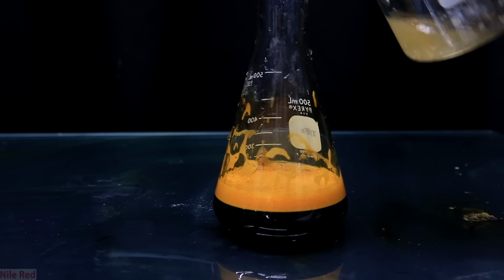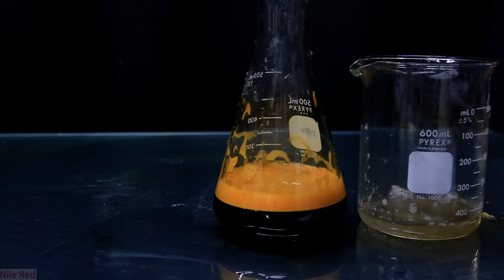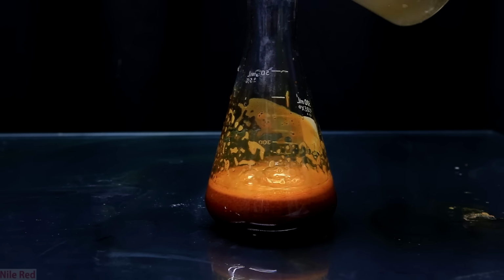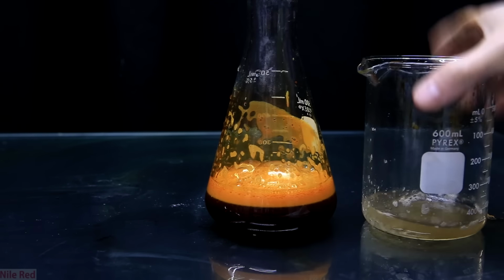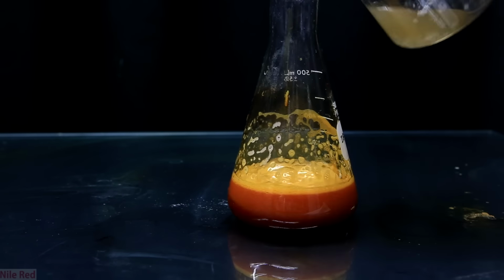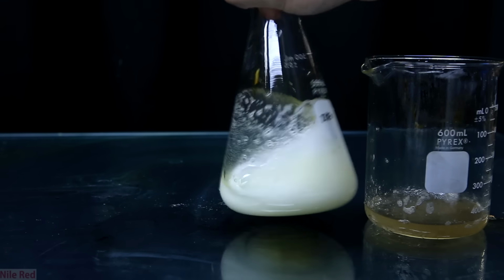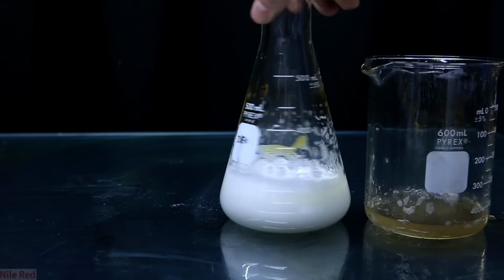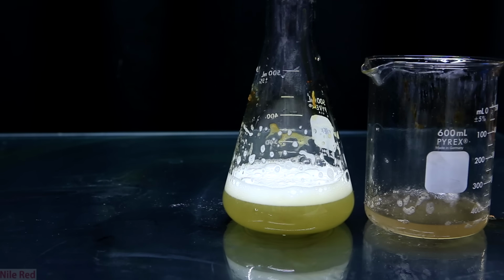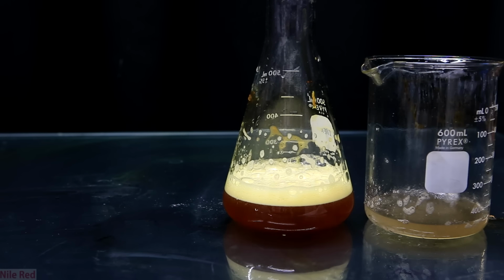Now for the interesting part that I totally didn't expect, but I probably should have. I added sodium thiosulfate to the hydrogen peroxide solution that we filtered the iodine out of. When this happens, the color immediately disappears and it becomes clear again. I'm not sure why, but the solution that we originally filtered the iodine out of was pretty clear, but after letting it sit out for something like a day, it became dark and reddish like you see here. Anyway, the cool part is that it quickly goes back to the red color.